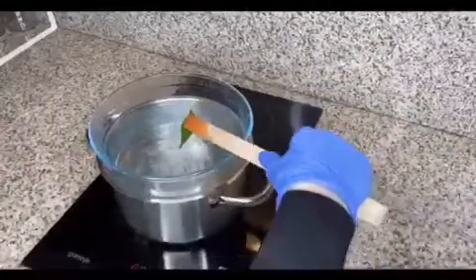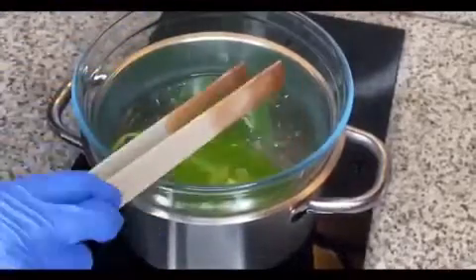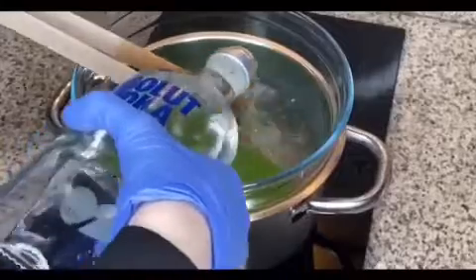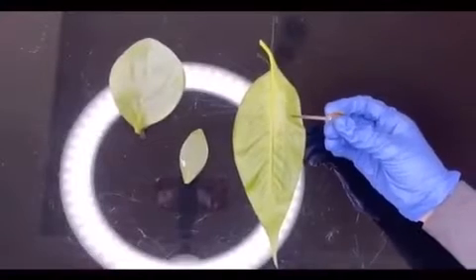After I've boiled the leaf in water, I will boil my leaf in ethanol for about four to five minutes, and that will hopefully remove the chlorophyll. After that, I'll put the leaf back in water for about 30 seconds to soften it.